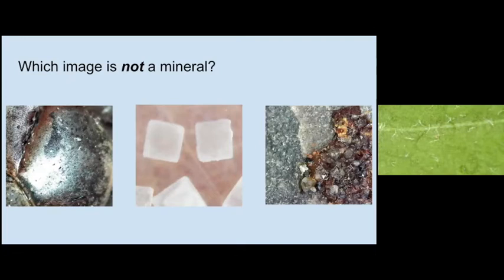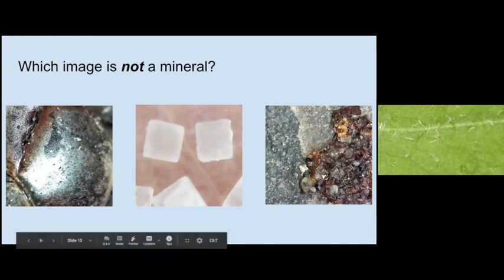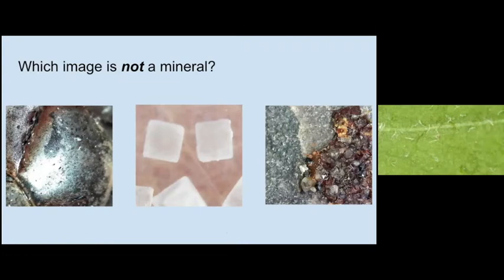That's a really good observation. Does anyone else have any observations they want to share? The first one, I think the first one's not a mineral since I think it's like a bug eye since I see the texture and I think I see a nose. So you are both exactly right.